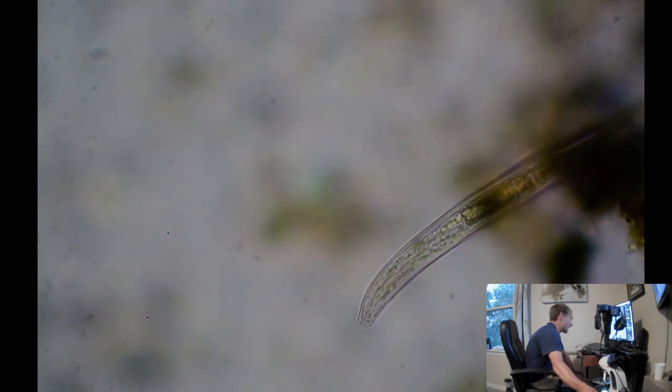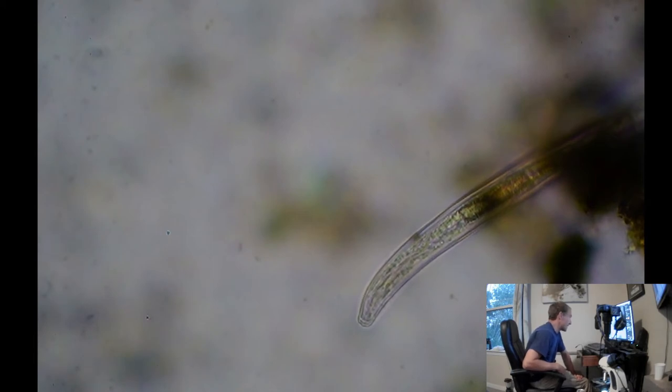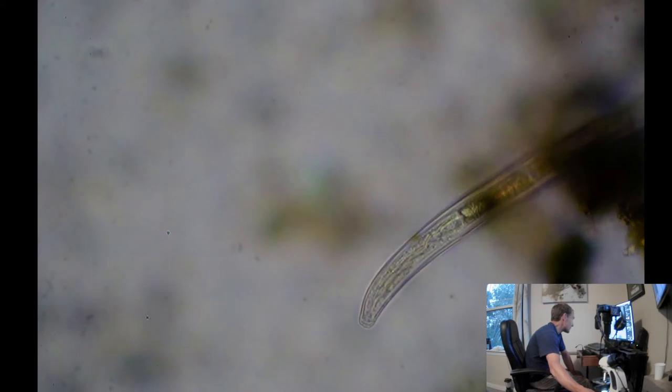I don't know. If I were to guess with the size of him and everything, I would say this guy eats other nematodes. Which is, I mean, predators are part of the soil food web and they're needed. Even though we like our nematodes in the soil, so don't eat them all, but still a good sign.